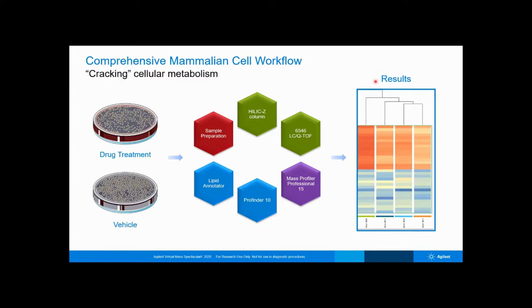The results of the comprehensive workflow are metabolite and lipid annotations, an analysis of whether there are significant changes to the metabolite or lipid upon methotrexate treatment, and an analysis of the specific metabolic pathways that are impacted by methotrexate.